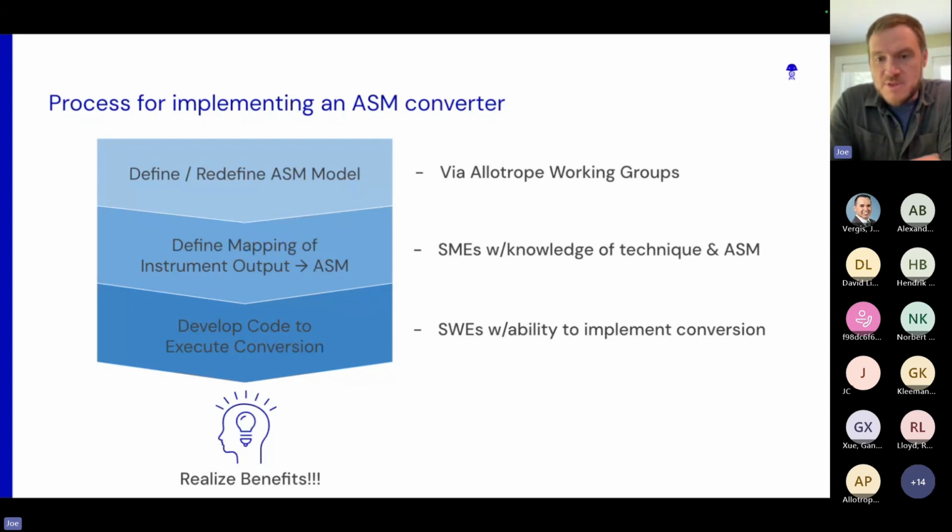I think actually the ASM themselves, an instantiation of these ontologies into a data model, we often find when we apply them to real instruments and real data, there's more work to be done. It's not a critique of the ASM, but more a call out to the community that there's still work to be done here. So I'll come back to that later.